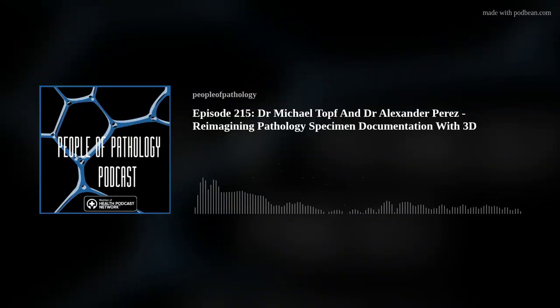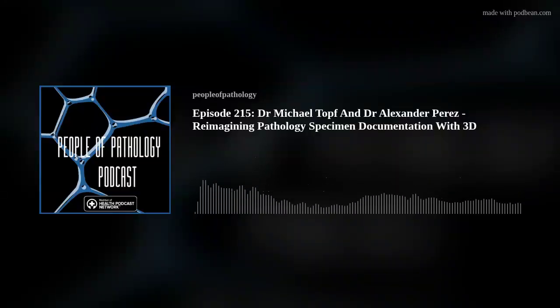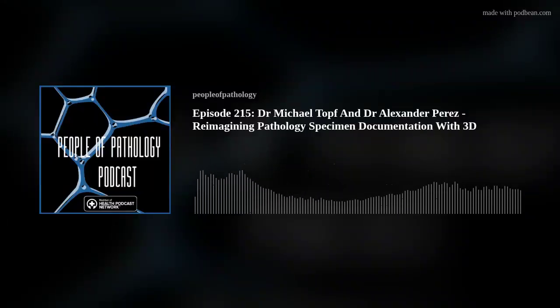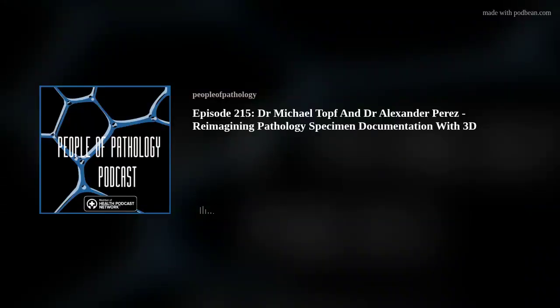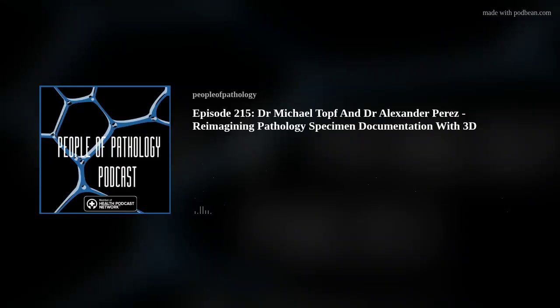That's where 3D scanning comes in. Dr. Topf and Dr. Perez walked us through how their team is using commercially available scanners, equipment that costs around $2,000, to create high-resolution models of surgical specimens. These models can be rotated and annotated. The best part? This technology integrates into the workflow with very little disruption, adding only about 8 minutes to specimen processing. For a tool that can dramatically improve accuracy and communication, that's an incredibly small trade-off.